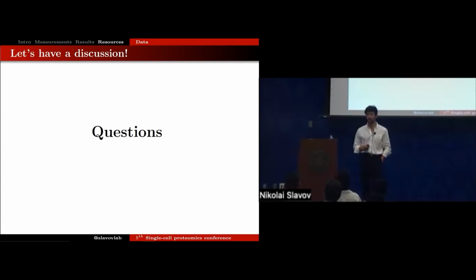We have thought a lot about it, and the gentleman sitting behind you has also thought a lot about it. It's a great question. Data analysis is very important. I did not cover it. At the moment, there are a number of pipelines that you can use, open source pipelines implemented in either R or Python. And that's a good start. At the moment, I think that's adequate.